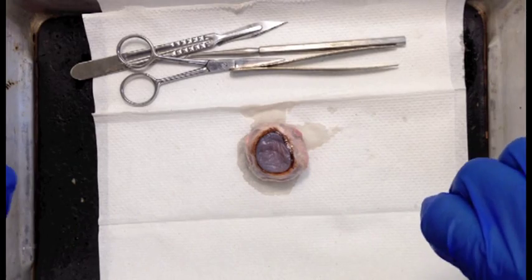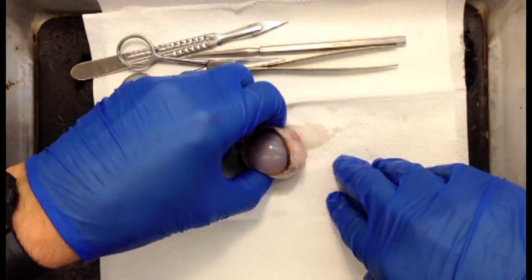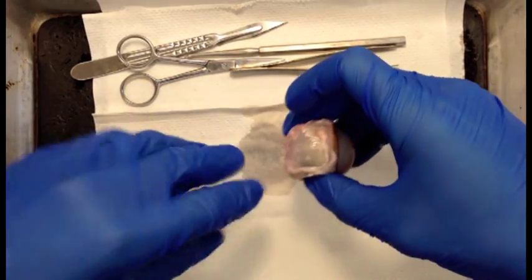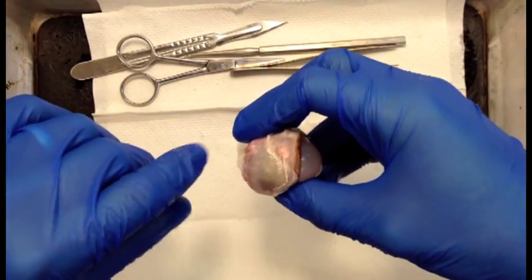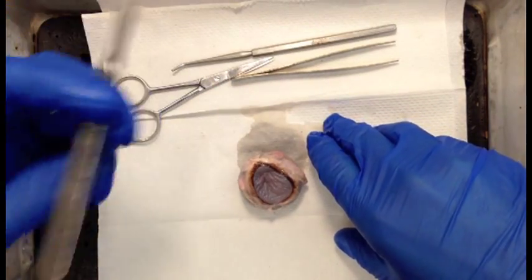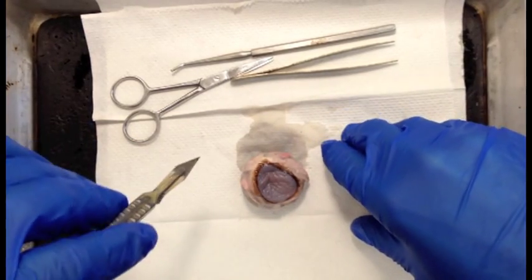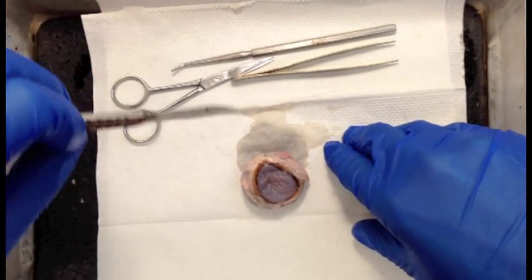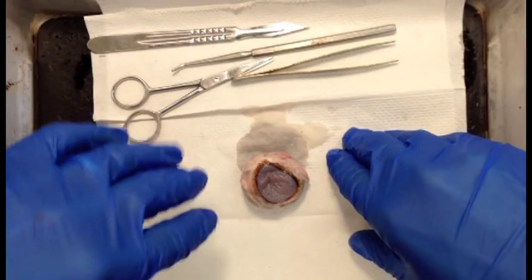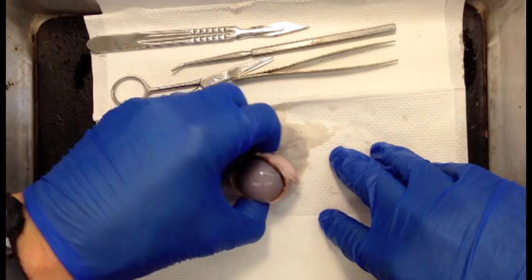Okay, now I'm ready to cut open the eye to point out the internal structures. To do this, it can be a little bit tricky because the outer portion of the eye, the fibrous tunic, is very tough. So if you were to just take the scalpel and start poking at the eye, try to push it through the eye, you're going to put the eye under a lot of pressure, and when you finally do make a hole in it, the fluid inside the eye can actually squirt out, and who knows where it's going to squirt. So we don't want to do it that way.